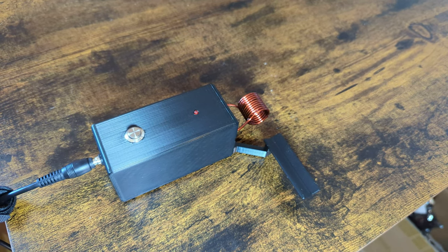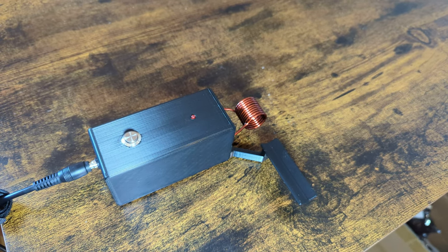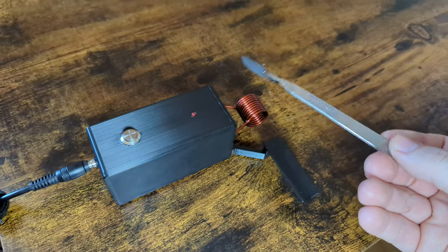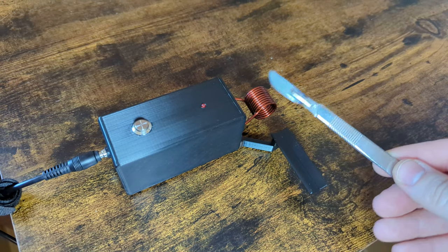Hey everybody, this is Chris from Chris3DPrints showing you today my new scalpel sterilizer. Use an all-metal scalpel just because this does use induction heating to heat up the tip.